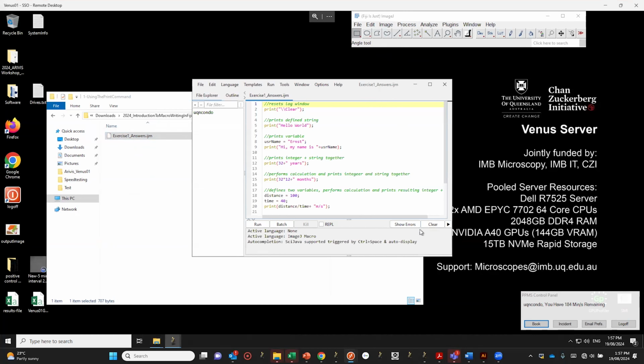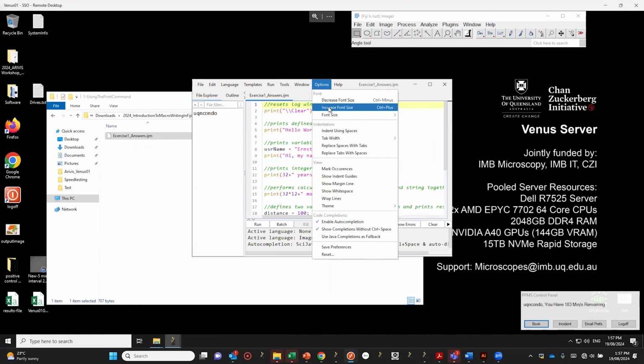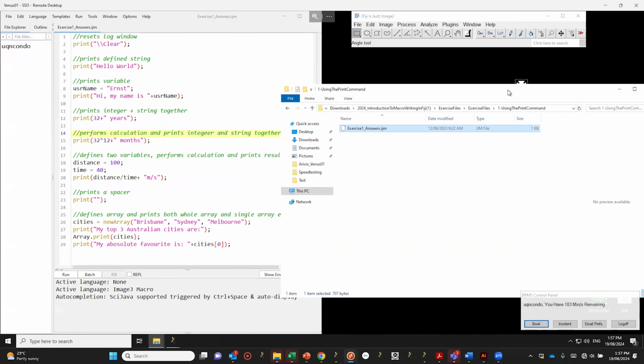So rather than have people watch me make spelling mistakes typing, that's horribly small. I have actually, you may have noticed, this exercise folder and the answer scripts are already there, right? So rather than just give you a picture and go, oh, that's the code, you've got to type it out, I have given you the macro file there. Now, that's not the only way to do these, right? With scripting, there's often going to be many ways to get to the same kind of result.